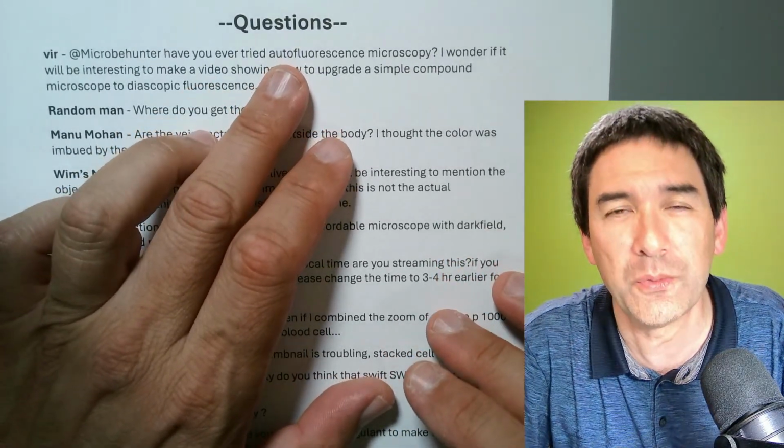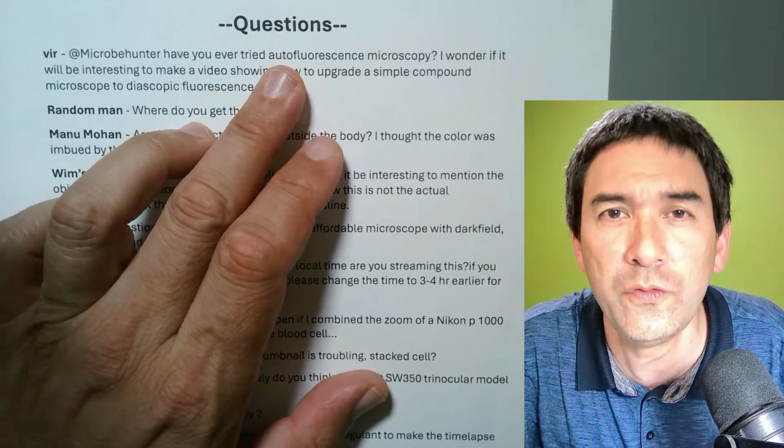So that is one thing. And number two, I've also experimented a little bit with so-called UV flashlights.